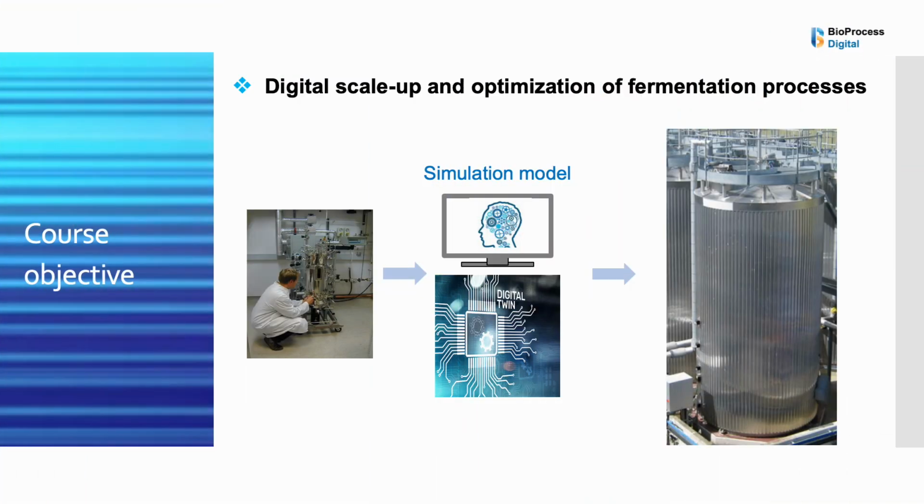In this course, you will explore the methodology for the digital scale-up and optimization of fermentation processes. You will learn how to design and utilize simulation models or digital twins of microbial fermentation to predict and optimize the operation of industrial fermenters.